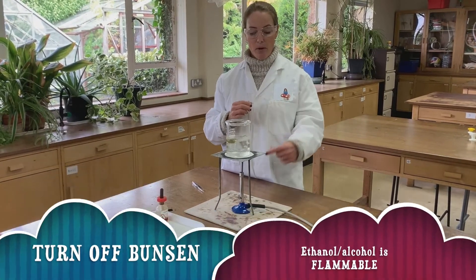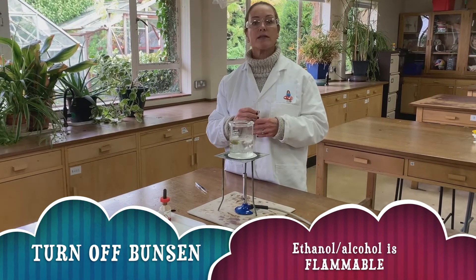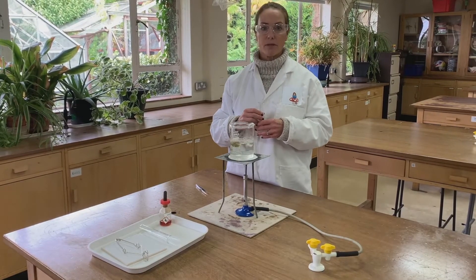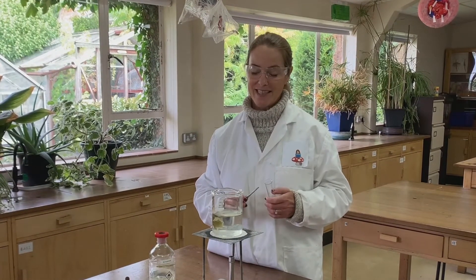However, at the moment we have the Bunsen burner still on, and ethanol is highly flammable, so before we can get the ethanol out we must turn the Bunsen burner off. Now that the Bunsen burner has been turned off — which is a very important safety point that often comes up in exams.